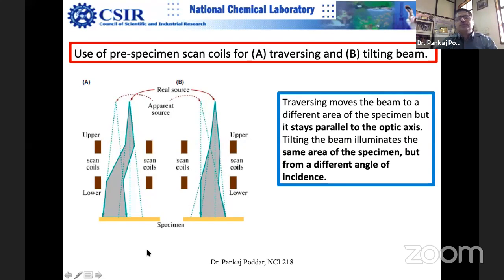So this is how it works in scanning electron microscopy, also SEM. The same thing is done in SEM, right? We have learned about SEM. There, I didn't tell you this tilting because it's already covered here. In STEM and SEM, this is how the beam is raster scanned, without having to move the source itself. So the virtual image is formed, basically, something like that.